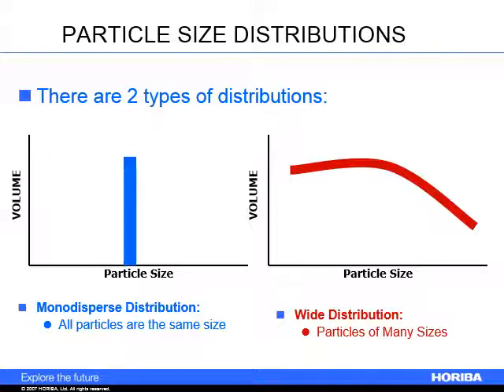You can exist in many different ways, but clearly the math that you do and how you give the resultant data, if you have multiple modes and you just give an average, is that really representative of what you have? It's probably not the best thing to only give. So I always consider this when I'm doing particle size analysis for a customer. Do they need me to break down each of the modes? Do they need me to give them a span? What are they trying to do with the results? Again, stuff to think about.